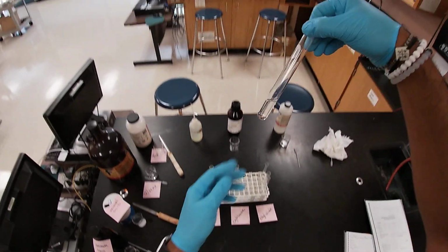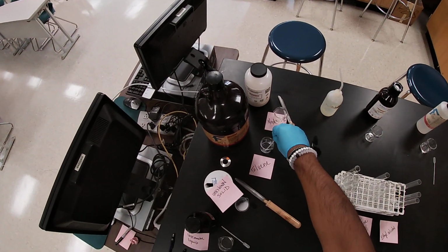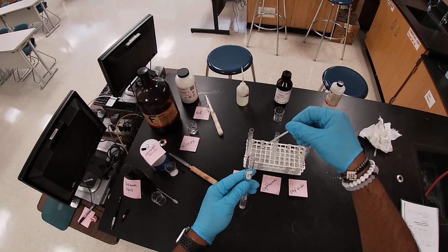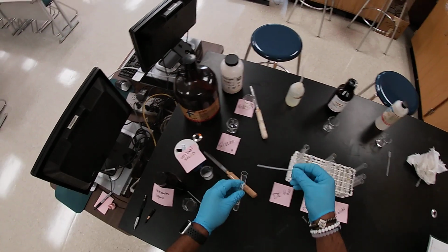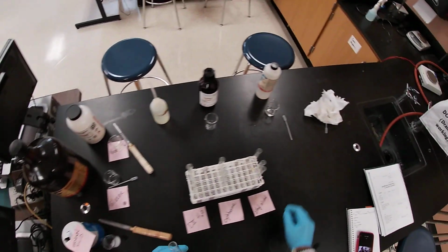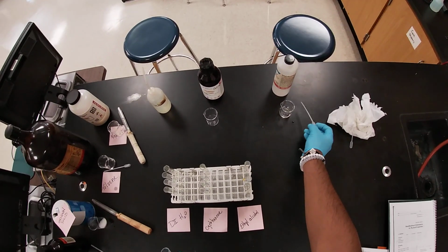And let's check for ethyl alcohol. And it seems like it is. Ethyl alcohol is soluble in toluene. Let me add some more just in case. Oh, it looks to be miscible. Add some more just in case, right? Add some more alcohol. And let's find out.